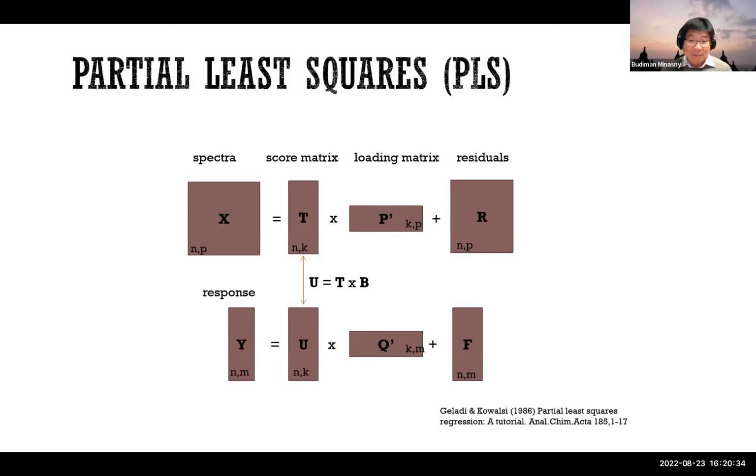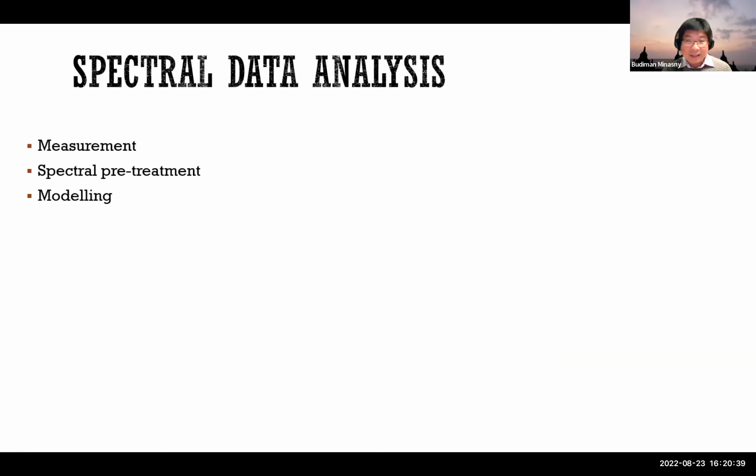So it is a multilinear regression problem, and it is the standard. It's not just in soil science, but in chemistry, as I say, chemometrics. This is still the most used method, partial least squares regression, and in machine learning people also use it for many other things. It's considered machine learning as well. I don't know why, but anyway, partial least squares originally came from analyzing spectral data in chemistry.